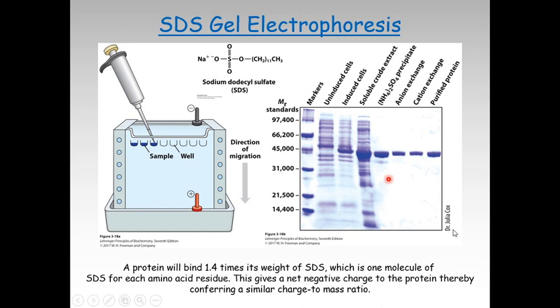As you can see, the gel on the right hand side, in this case, is after the electrophoresis is done. Once the electrophoresis is finished, you take out this gel cassette and remove the gel, and you stain this gel with a dye called Coomassie blue. Coomassie blue is a hydrophobic molecule that binds to the proteins, thereby providing blue color, right? And that is how you can monitor these proteins.